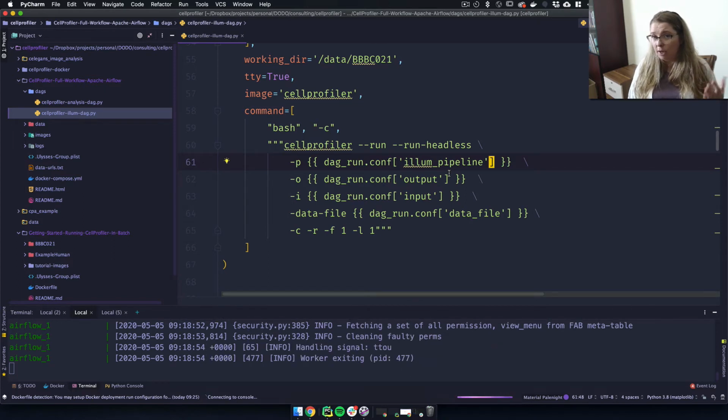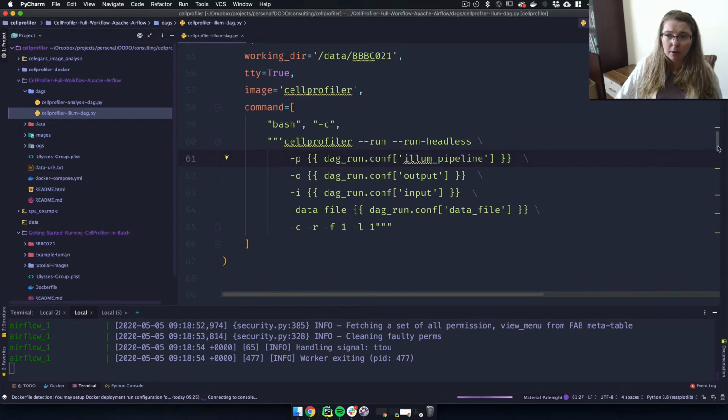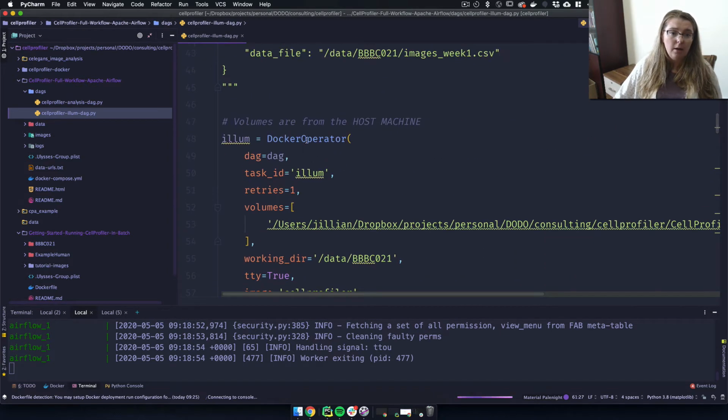That's very important, because you don't want to have things too hard coded. You want to be able to use them several times. So Airflow does that by having this templating system. You pass in a configuration object as a JSON string. There are a few different ways to do that. I'm going to show you one through the web UI, but there are several different ways to do it, just so that you can keep that in mind.